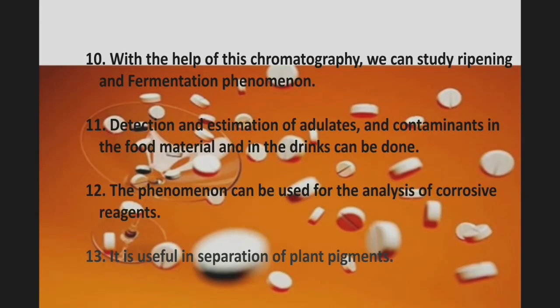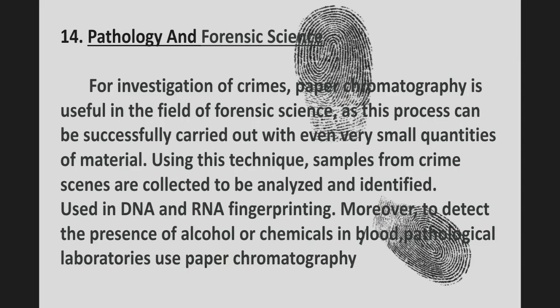Then the tenth, with the help of this chromatography, we can study ripening and fermentation phenomena. Eleventh, detection and estimation of adulterants and contaminants in food material and in drinks can be done. And the twelfth, the technique can be used for the analysis of corrosive reagents. And the thirteenth, it is useful in the separation of plant pigments. And the last, pathology and forensic science.